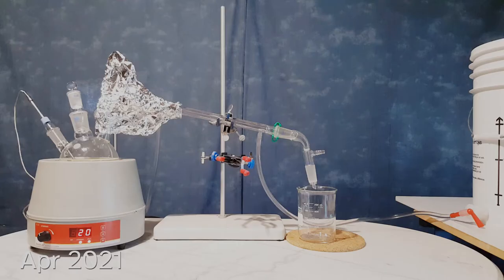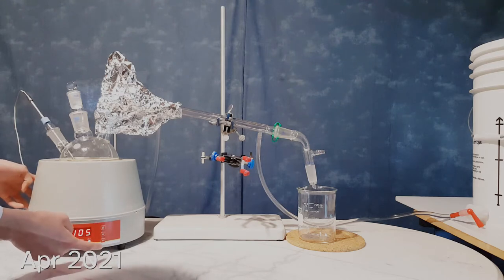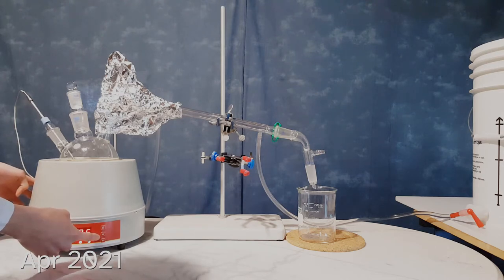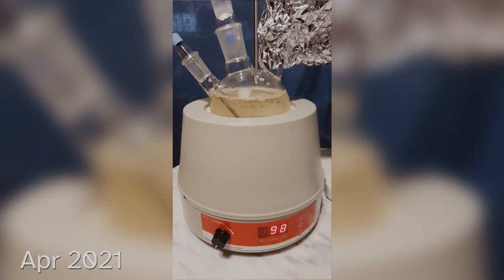The controller set point is set to 105 degrees Celsius. Using the temperature probe, the heating mantle will use a PID control algorithm to raise the heat until the temperature probe reads the temperature we entered. Since water will never get hotter than 100 degrees at atmospheric pressure, setting it to 105 essentially tells the controller to keep adding heat no matter what, which means we're always producing steam. That's what we want.